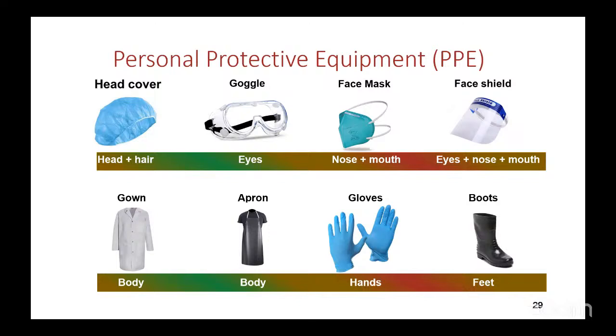You know, when we do this, we breach safety procedures. Not only that, we do it not because we are afraid. You have to be careful because every sample is a potential hazard. It is not as a result of fear, but as a result of being safety conscious.